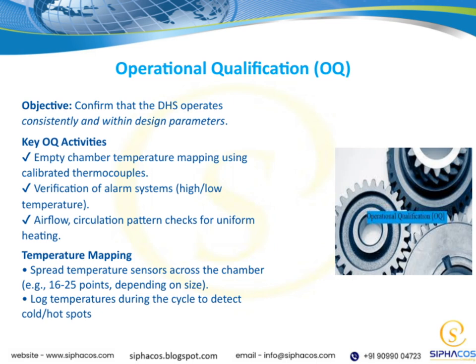We also verify the alarm systems, particularly the high and low temperature alarms, to make sure they function correctly in case of any deviations. Additionally, we check the airflow and circulation patterns within the chamber to confirm that heat is evenly distributed and there are no cold or hot spots.